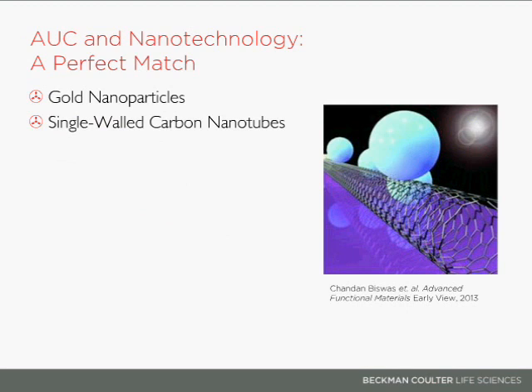But AUC is able to pull together all those measurements into one. So when a regulation agency, say the FDA, wants you to fully characterize your nanoparticle before you put it in a human being, and you understand the aggregation effects and the conformational effects of your surfactant at various concentrations, AUC is able to provide that information.